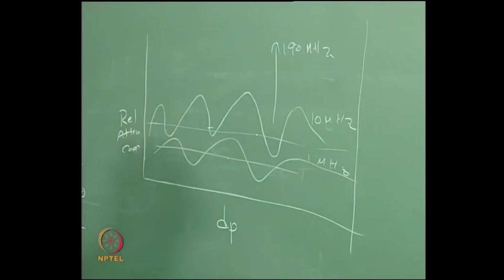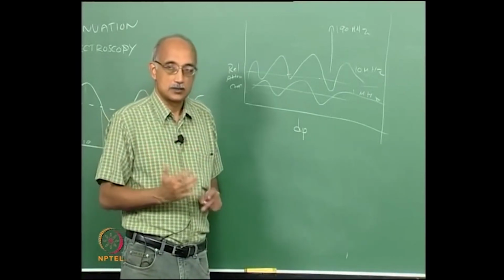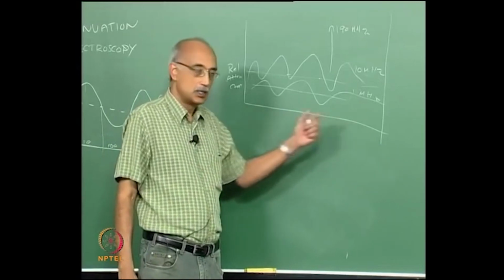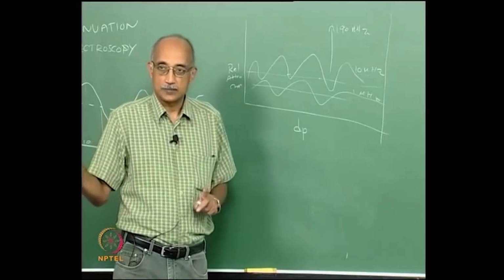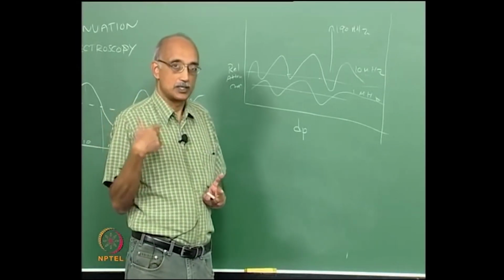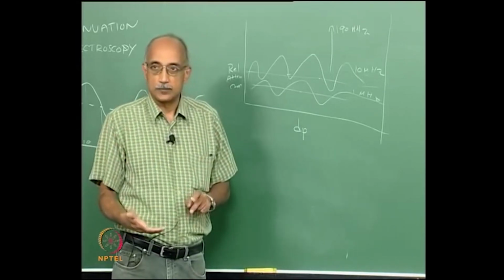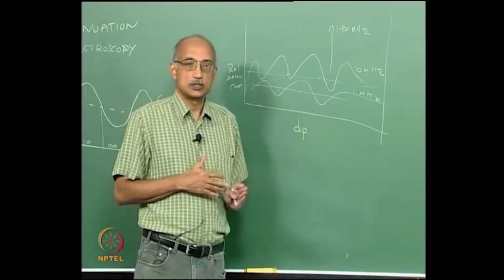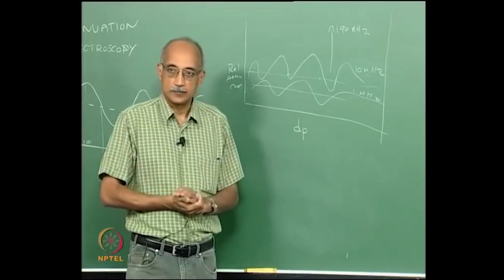There is no attenuation of the intensity by particle size. You can go from very small sizes to very large sizes without there being a significant systematic difference in the attenuation coefficient, unlike in the light scattering case, where there is clearly no way you can use light scattering for particles that are smaller than a certain size. Inherently there are no limitations to using this acoustic technique over a very wide particle size range.